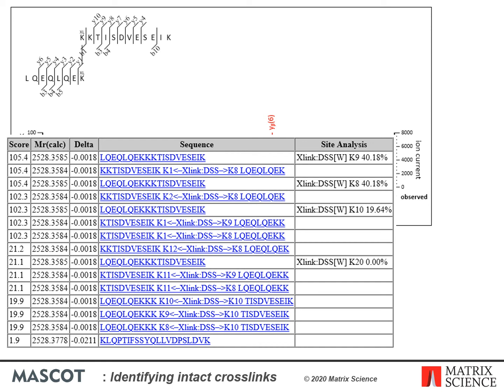It turns out beta and alpha are sequential in the protein sequence. The concatenated beta-alpha sequence with a water-quenched monolink has exactly the same score and equally convincing fragment matches. The location of the potential monolink and crosslink is also in question. The MSMS spectrum has no evidence to differentiate between the alternatives, so choosing the correct match requires consulting structural data.